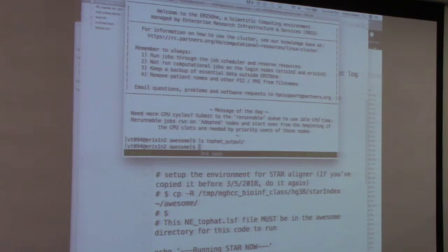Where did we copy the last one? No, you were also supposed to delete that, so your file is going to run in the wrong place, but I can fix it. I did delete it though. I was supposed to delete this? No, delete the cd. Oh, because it was going to the cd. So now it's in the cd directory, and that's keeping this from running correctly. So now type bjobs and hit enter.